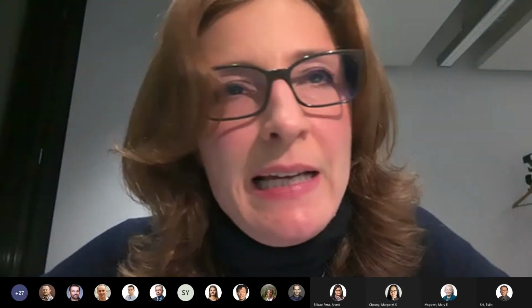Thank you. So thanks for your question. The first data set I discussed was the osmotic stress data set, where the time scale was about 10 minutes. Heat shock was 3 minutes. So this is really short. Maybe you can go even to shorter time scales, but this we haven't tried. Under those conditions, protein abundances didn't change a lot.